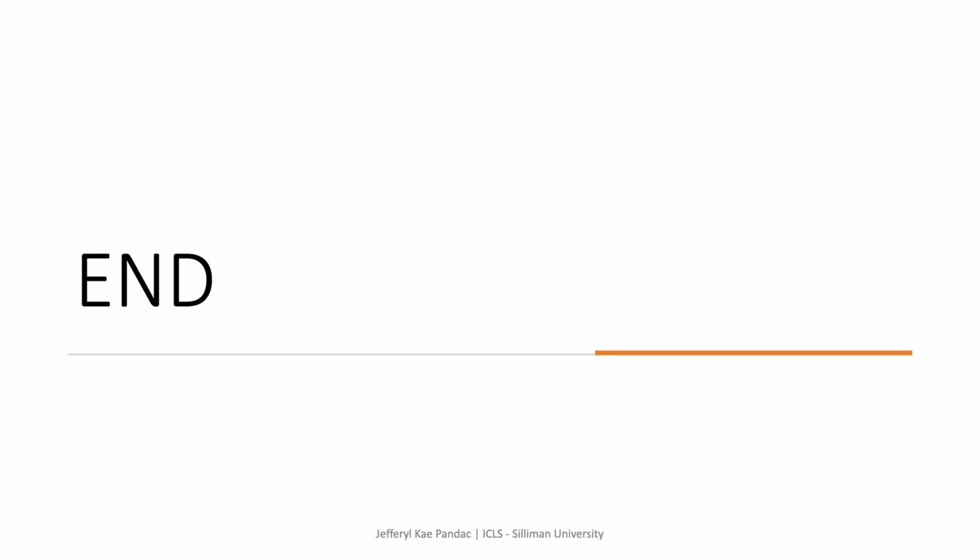So this ends my discussion of the three techniques in protein analysis, which include SDS-PAGE, Western blot, and MALDI-TOF. Another important protein analytical technique is ELISA, or enzyme-linked immunosorbent assay. This topic will be covered in your laboratory class.